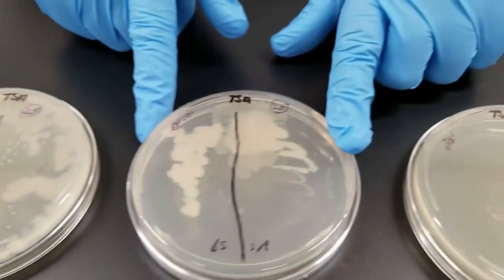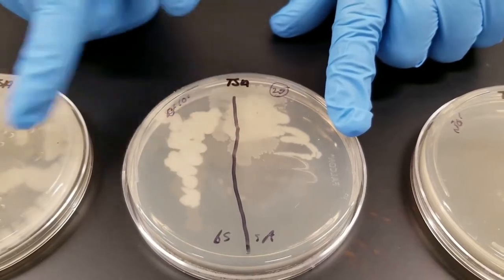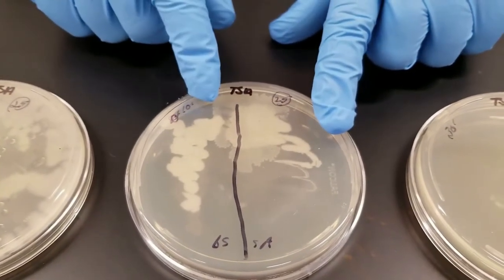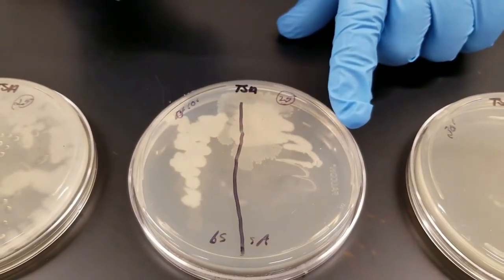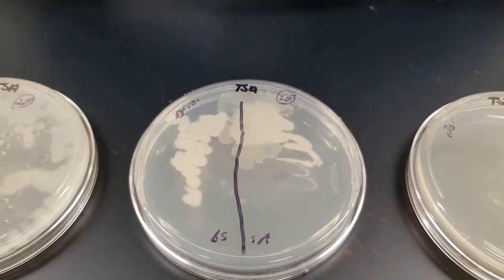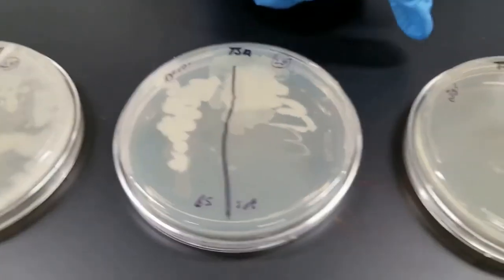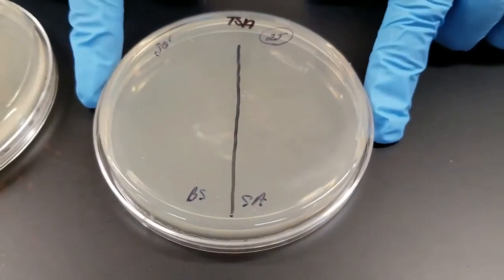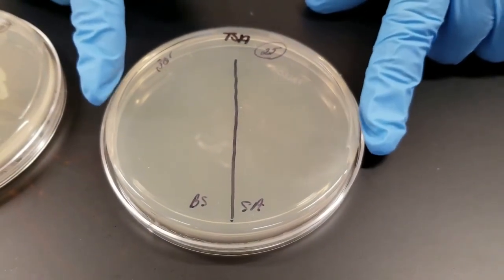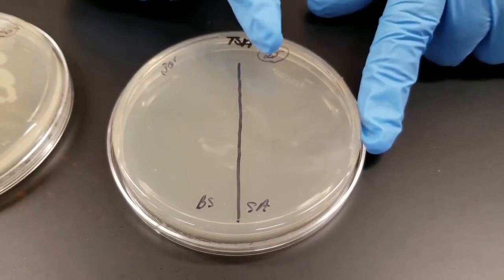This plate now we had exposed to UV light for 10 minutes. So you can see there's a decreased amount of growth. I suspect on this plate for 10 minutes, the growth is due to the endospores germinating, and you have now the new vegetative cells from that. And then this plate over here, exposure time was 30 minutes to the UV light, and at this point it did kill the spores, so you have no growth whatsoever.